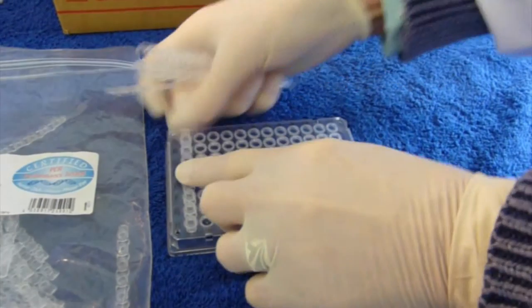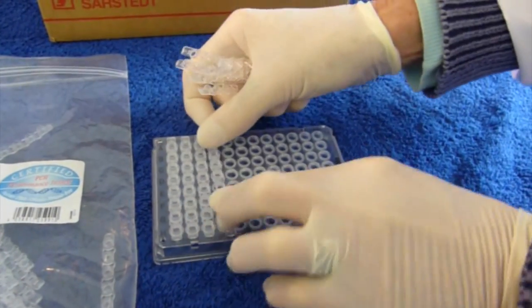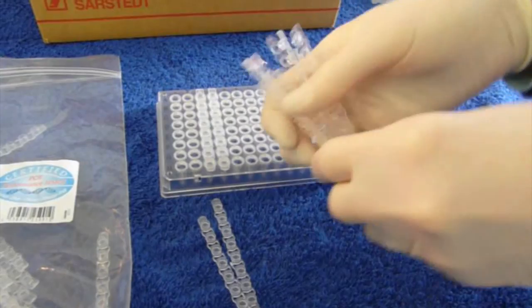Using the incorrect flat caps will result in loss of DNA sample, as you will discover that the flat caps made in Germany do not fit securely.